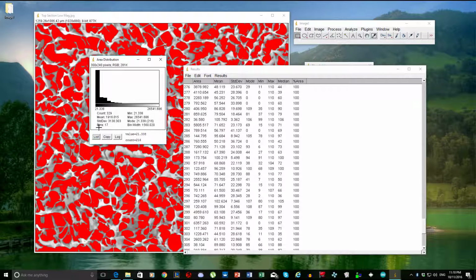And bins, I really do not know what it is. Mode, I don't know either. And bin width, I don't know either. But I know that you have to show this whole thing in here. I think you have to show it for either the last part of the second question or the third question, where you have to compare your results with the data that she posted online in the course documents for the lab.